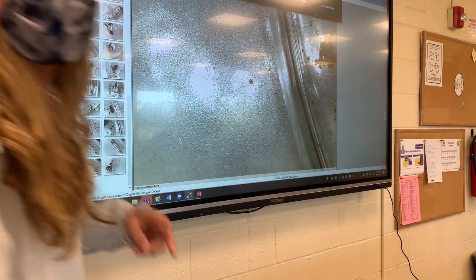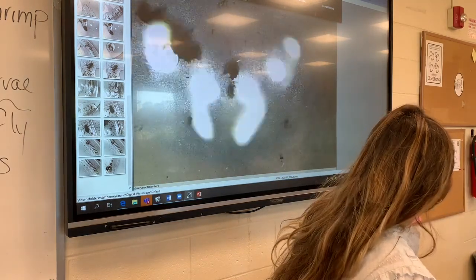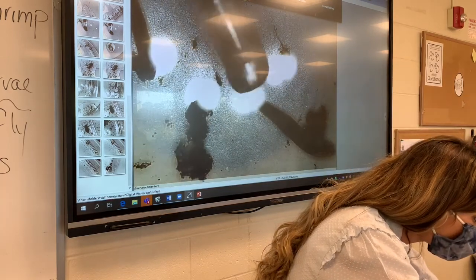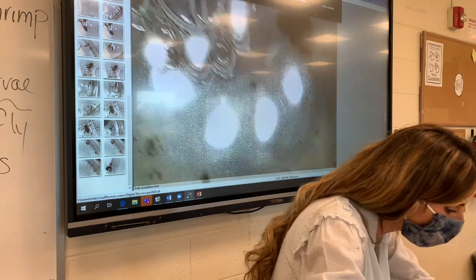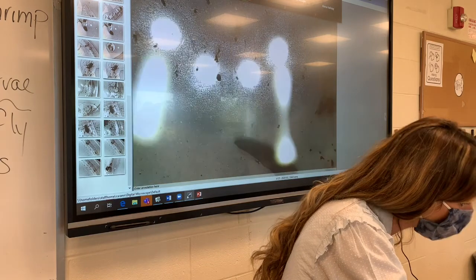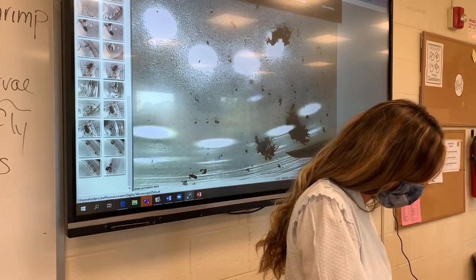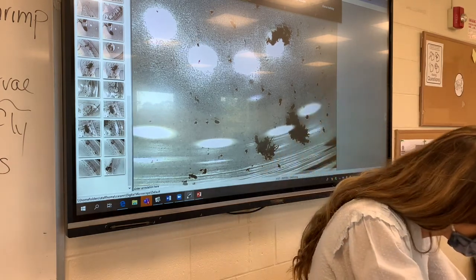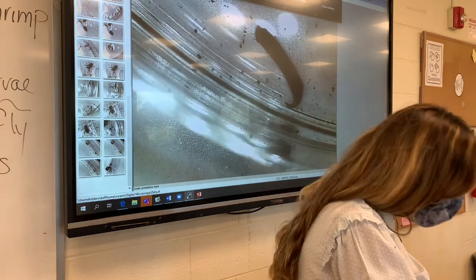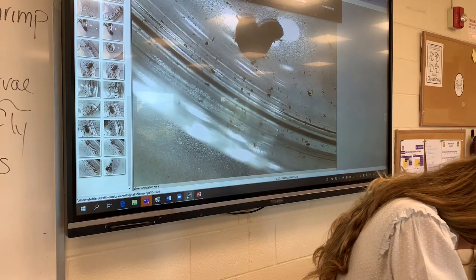Planaria cutting, take two — we did this earlier. I'm trying to make them into two. There's the big guy, you see him up on the screen? There are two of them there. I'm going to transfer this guy and put him in here, and try to do this so you can see it on the screen. They don't like the light — they're constantly moving away from us. I'm going to pick up our scalpel. Now's my chance... I didn't do it. I'm chickening out.